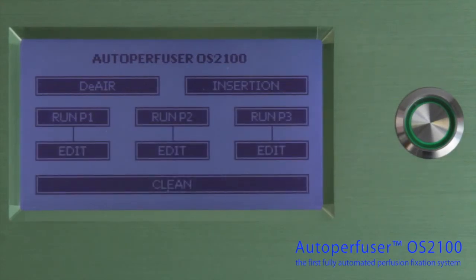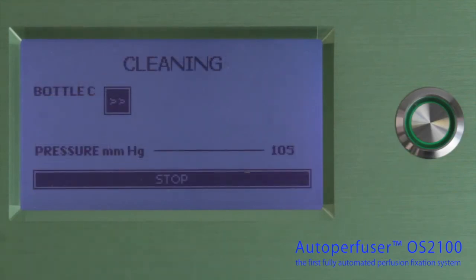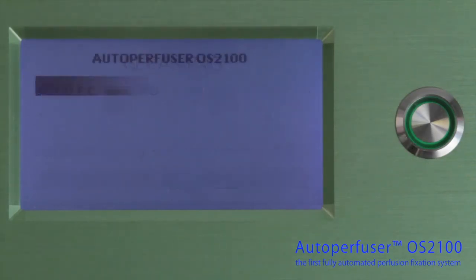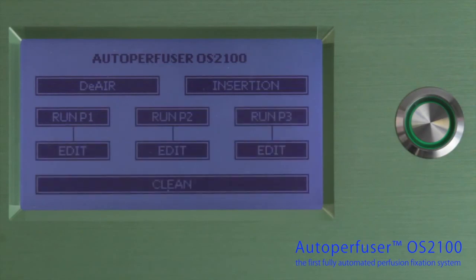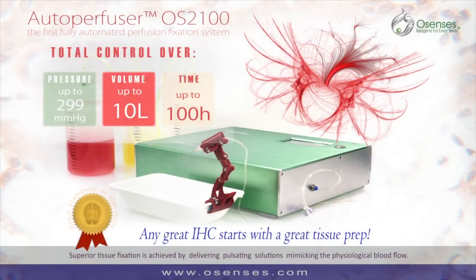The Autoperfuser runs a self-cleaning program. Press clean to automatically purge the tubings with the cleaning solution. Easy, time-saving, perfect perfusions. The Osensis Autoperfuser fixes the tissues. Naturally.